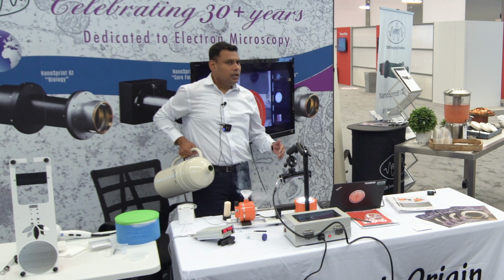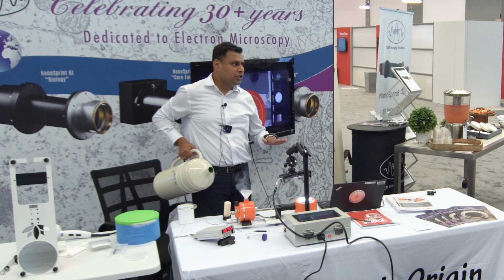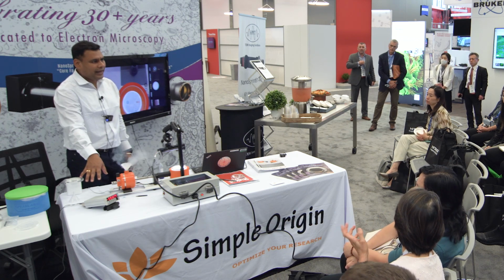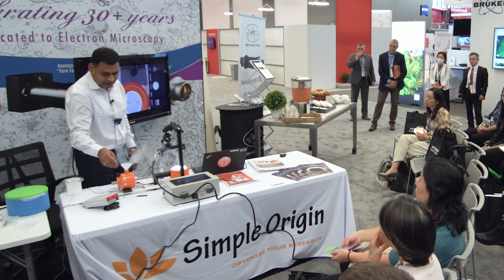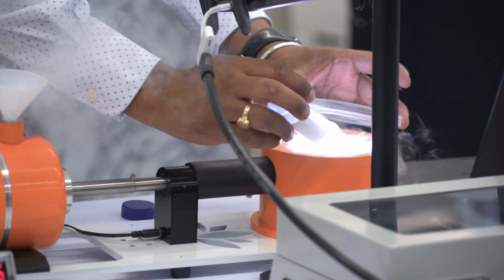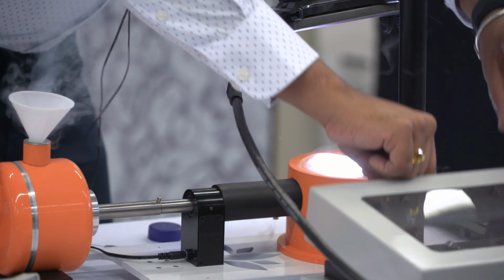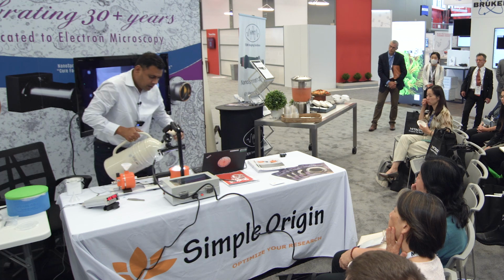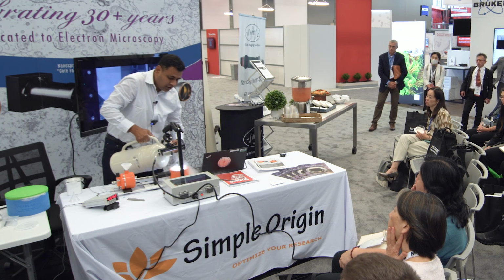So for those who don't know, if the temperature rises above minus 145, minus 150, you're going to get devitrification of the ice, and basically your sample is going to be ruined. While it's cooling, you would normally wait till it's minus 190 or below. But just to save time, I'm going to just continue with the process. You're going to get your cryo sample, and this is going to be in liquid nitrogen. You're going to bring it and keep it in the workstation. You want to make sure you maintain the level of liquid nitrogen so your samples are not destroyed.